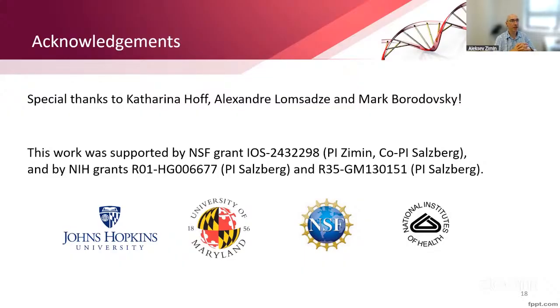But my recent experiments show that PacBio Kinnex data can outperform Illumina RNA-seq. With the cost per gigabase about the same, about $10 per gigabase, I fully recommend you use PacBio Kinnex data if you can get your hands on it, to replace Illumina RNA-seq data. And so assemblies will be more complete and transcripts will be more correct.